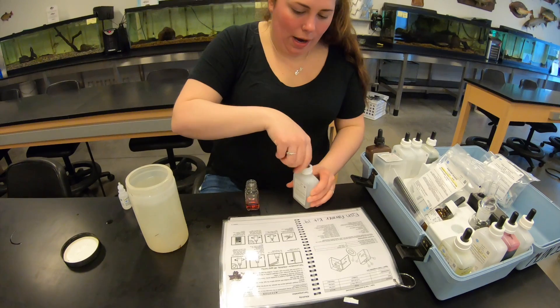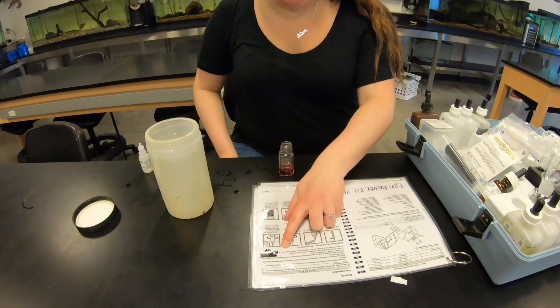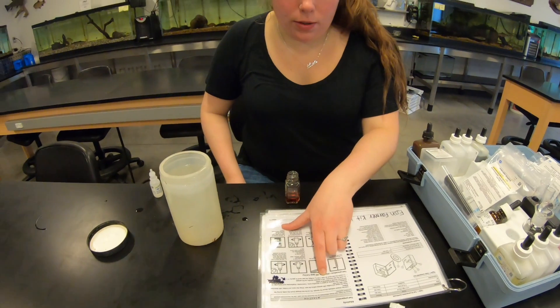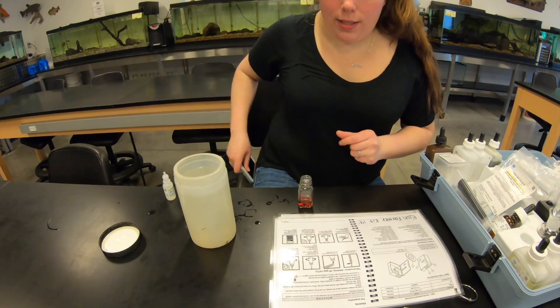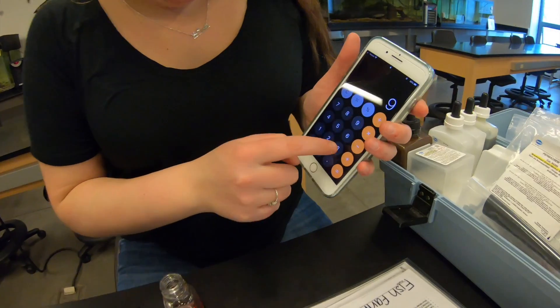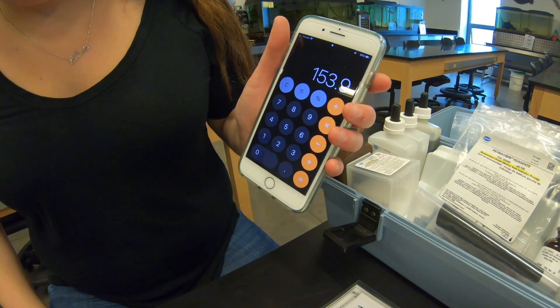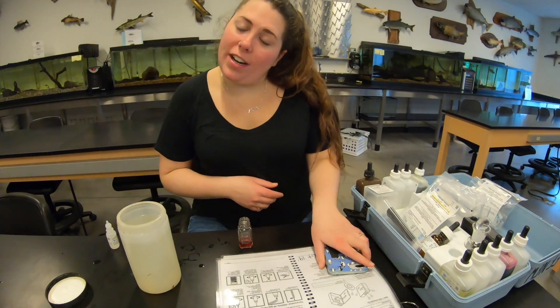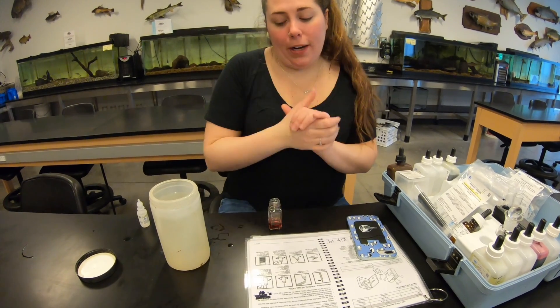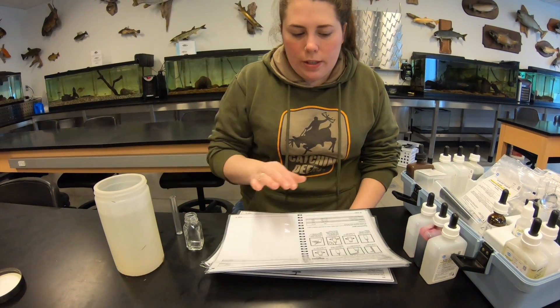With that drop count of nine, you multiply by 17.1 as directed to get your result in milligrams per liter of CaCO₃. Nine times 17.1 gives us an alkalinity of 153.9 mg/L. Most of you know from the limiting factor sheet that the optimal alkalinity range is about 100 to 400, so this is within optimal range.